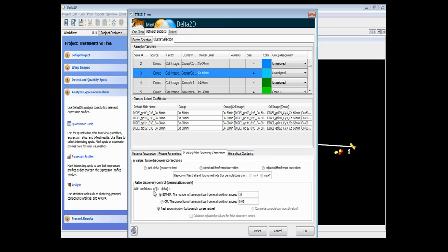This is important to do because we have here maybe 1,000 or 2,000 spots in our experiment, and that means we repeat the t-test for each single expression profile again and again. And as you are aware, the more often you play the lottery, the more often you win. But you win just by random, not because you have known the numbers in advance.